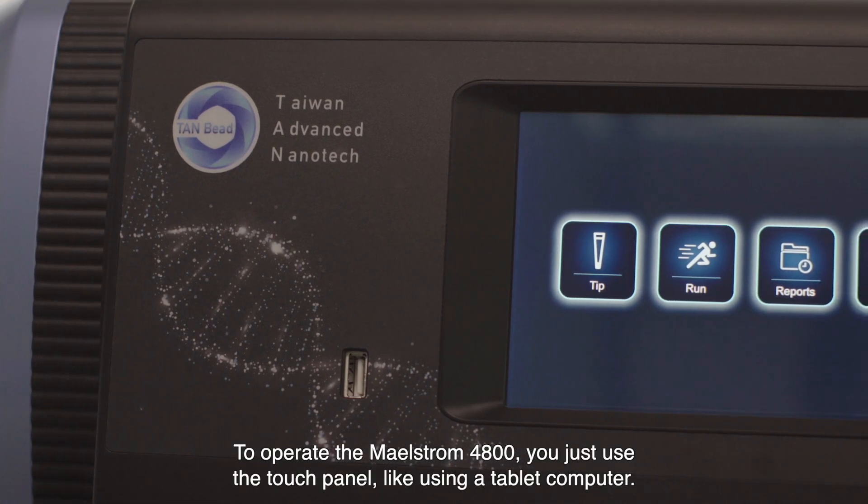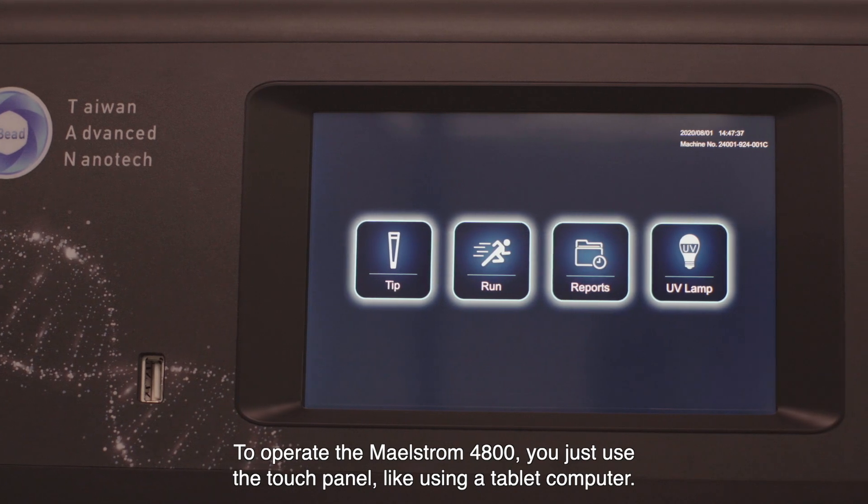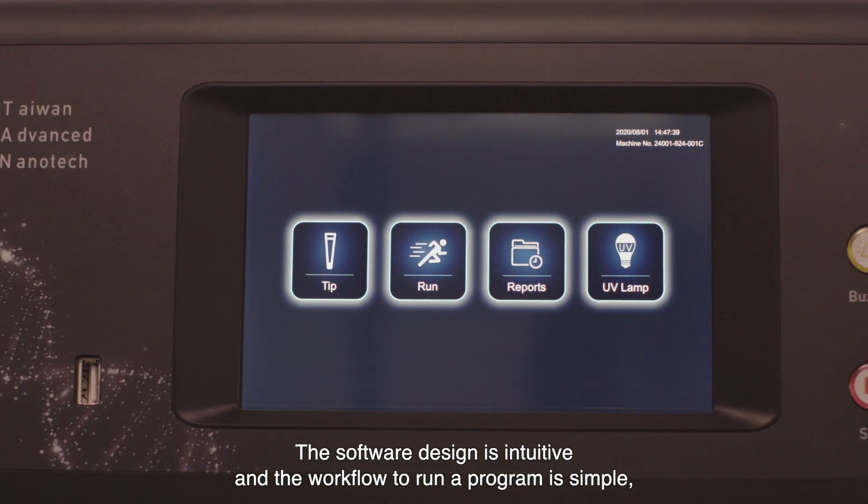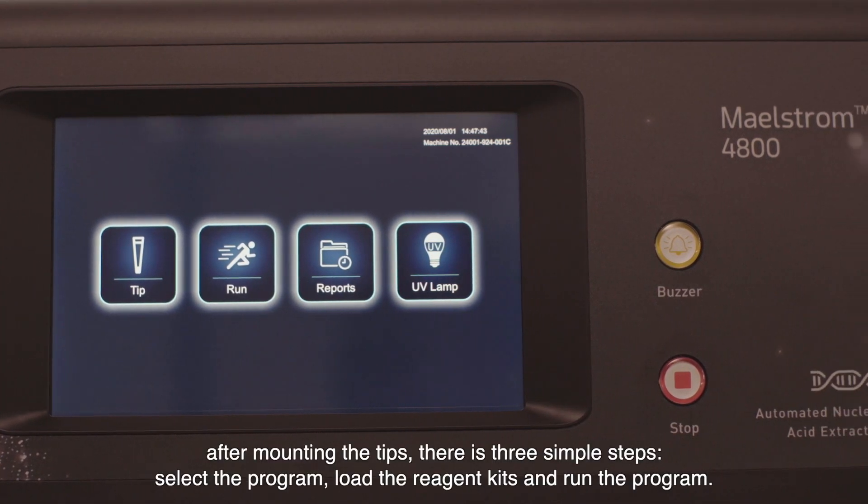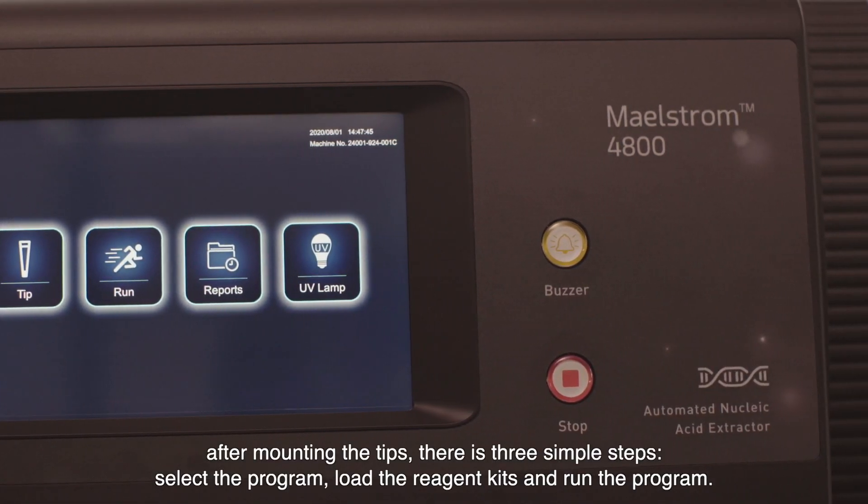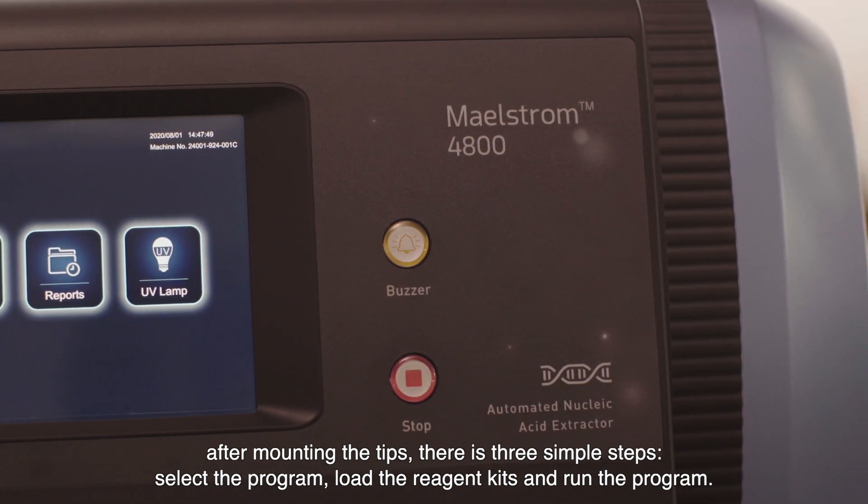To operate the Maelstrom 4800, you just use a touch panel like using a tablet computer. The software design is intuitive and the workflow to run a program is simple. After mounting the tips, there are three simple steps: select the program, load the reagent kits, and run the program.